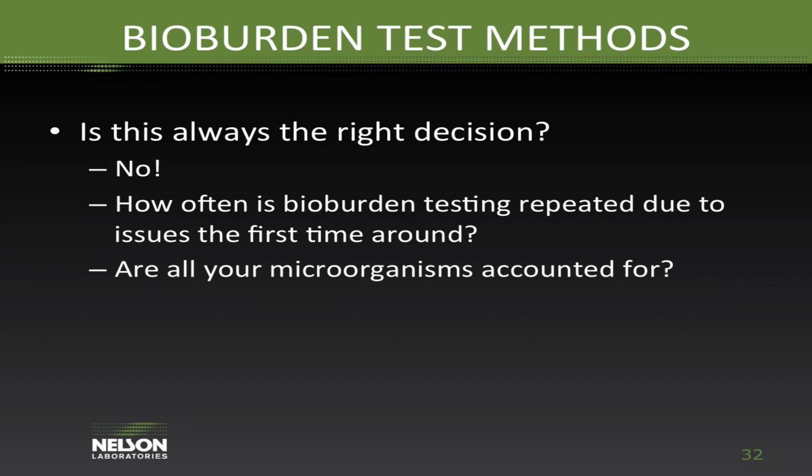And that's related to those bottom two bullet points there, where how often does bioburden testing have to be repeated? So we get samples all the time. We say, okay, well, this makes sense. And the manufacturer says, well, yeah, it makes sense to us. Just do what you normally do. And then we do it once only to find out that something doesn't come out quite right with the test. So we have to go back and repeat testing.